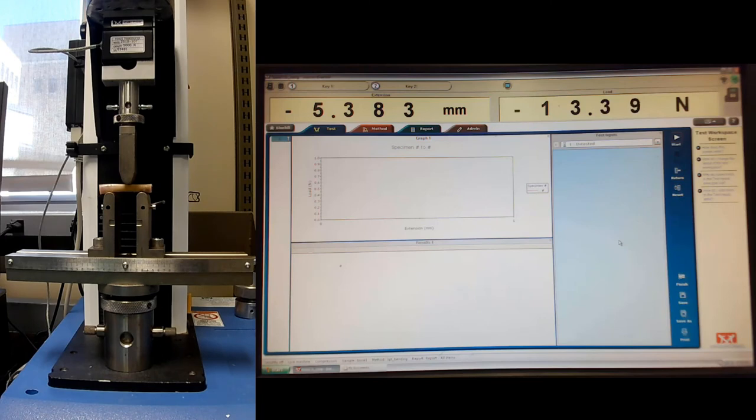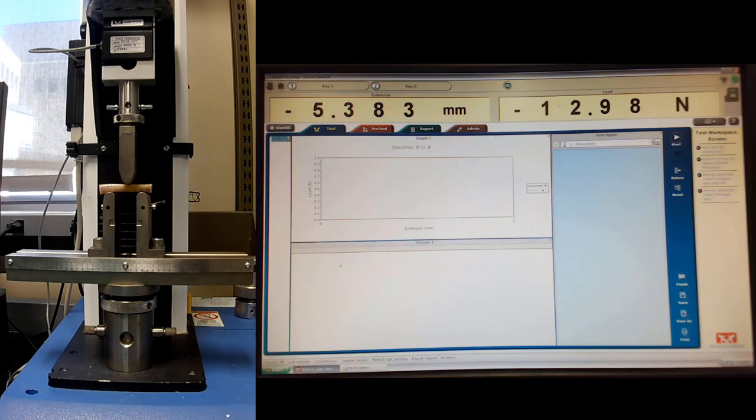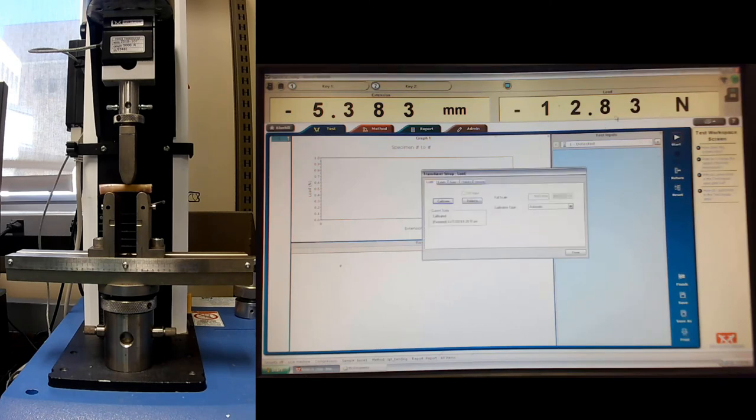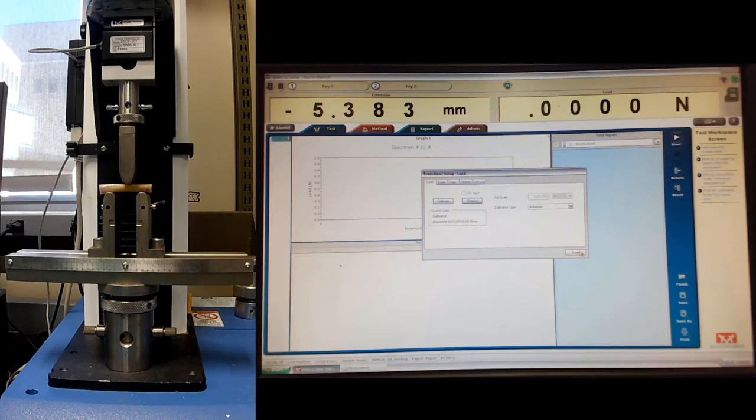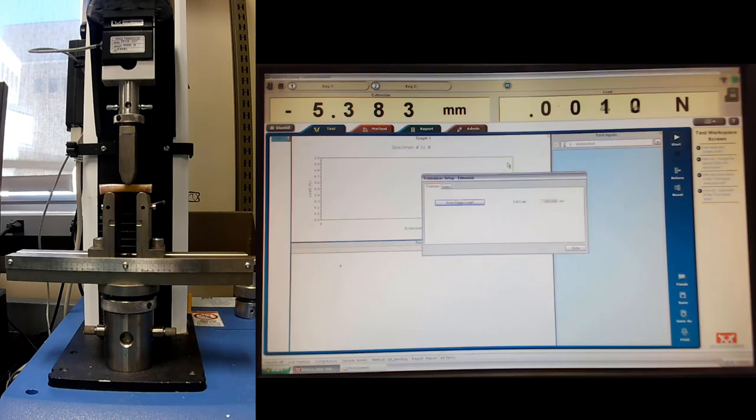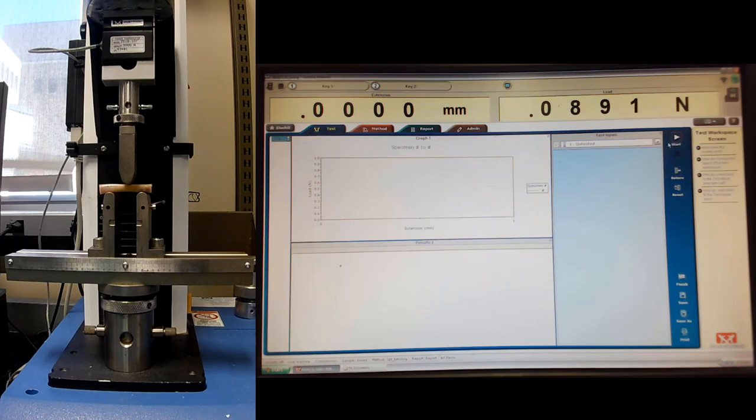Our load is just negative 13. That's fine. We're just looking for this linear region between displacement and load. So I'm going to go ahead and reset, balance the load cell. Reset my gauge length. And go ahead and run our test.